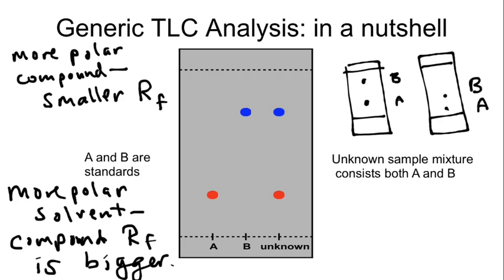We're increasing the push. Our solvent is merely a pusher. The more polar our solvent, the harder it pushes. Okay, the more polar the compound, the tighter it holds to the stationary phase. Okay, so we're not separating our solvent. Our solvent is always, always, always pushing, always washing over. Okay, so you got to make sure you keep those two things separated and away from each other. Yes, I know it's confusing, but make sure you treat them differently.